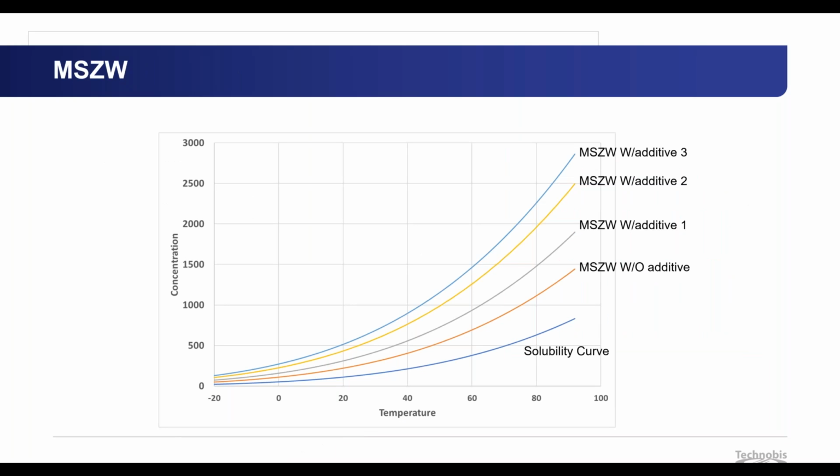And here is also some data where you see the solubility curve of a compound, and actually the different metastable zone. So what you see in the different colors here are actually the nucleation curves, the supersaturation curves of the different API with the different additives.